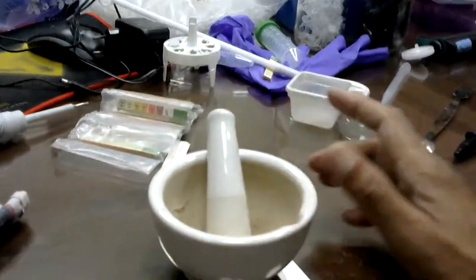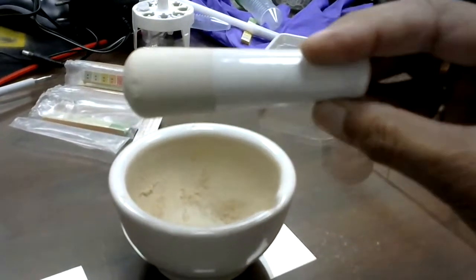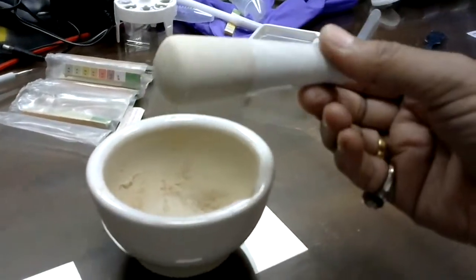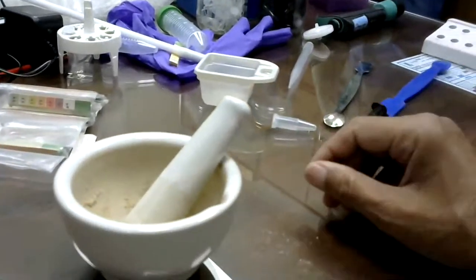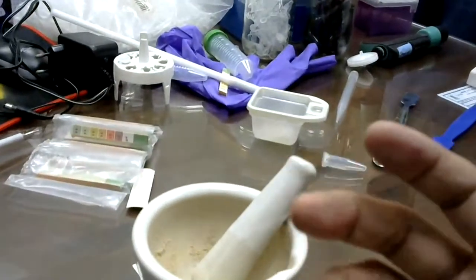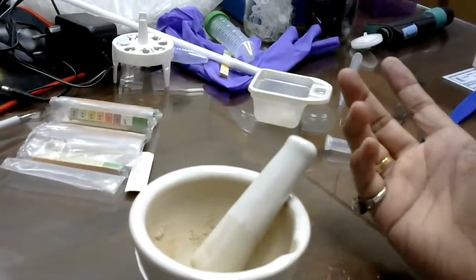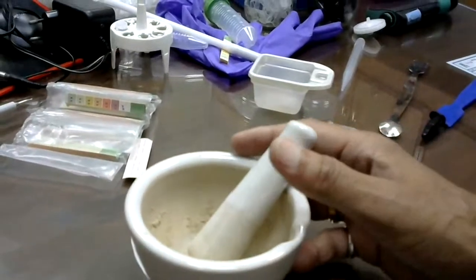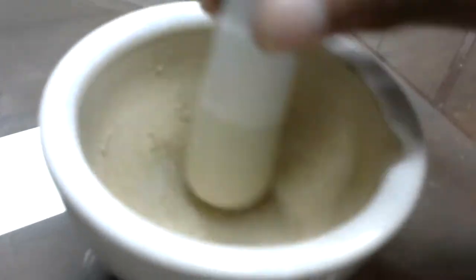Now I will try to show you what this is. This is a pestle and mortar. Whenever we are trying to homogenize or grind samples or some tissue, maybe leaf tissue, root tissue, or whatever plant tissue, animal tissue, we put it inside and then do the grinding like this, holding and then grinding.